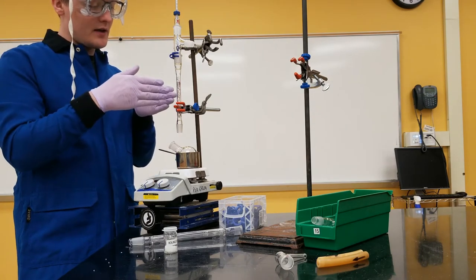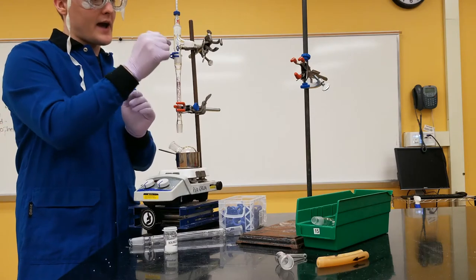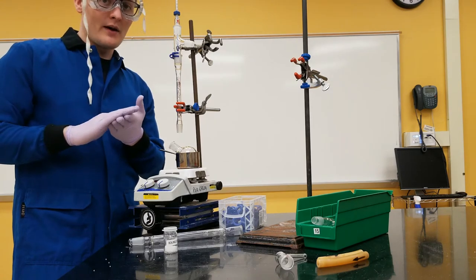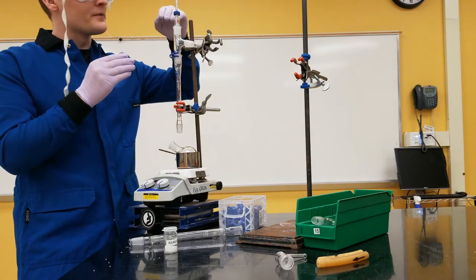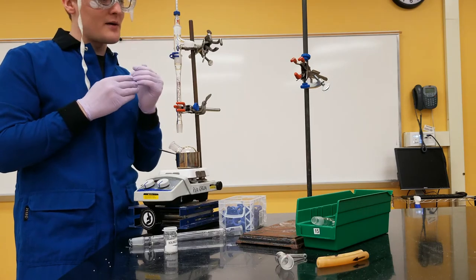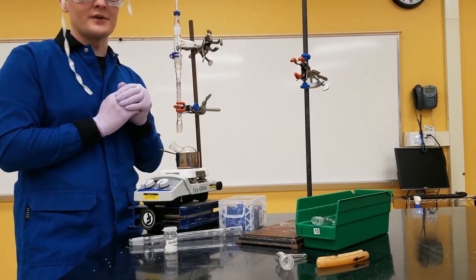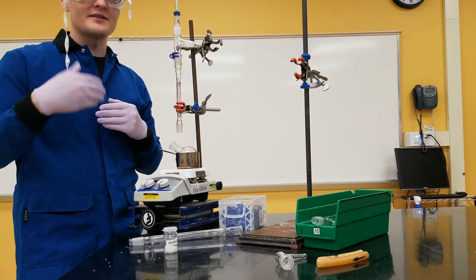So after the solvent has heated up this copper coil and it passes up here, then it's going to have to heat up my thermometer bulb before it's allowed to proceed out of the system. Now, it's going to heat up the thermometer bulb to the boiling point of that solvent. And so I can sit here and watch my thermometer get hotter and increase its temperature reading. And when it plateaus, when it stays steady at a certain temperature, that means that the solvent that is heating it up, that's the boiling point of the solvent, and the solvent is now going to be escaping out of this arm, out of the system for collection. So the thermometer allows me to identify and track the solvents which are escaping out of the system.